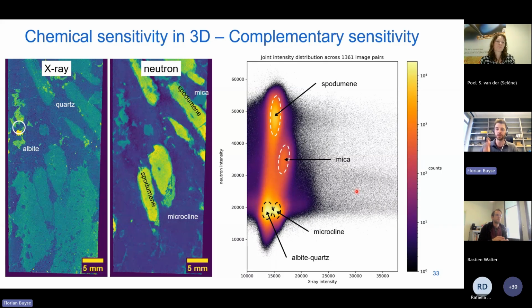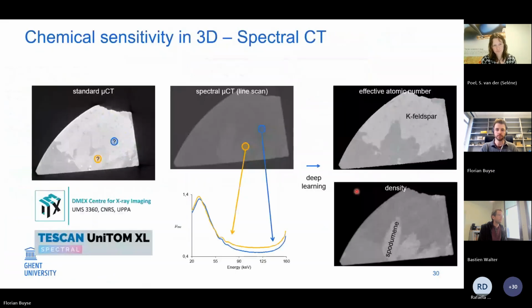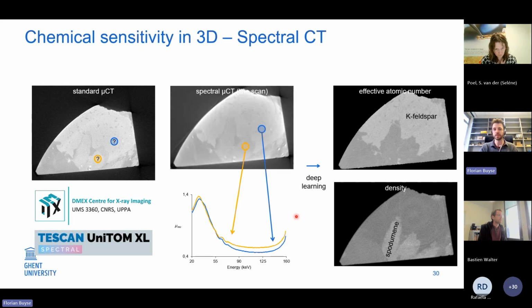Whereas if you only looked at the standard CT scan of the same slice, in some cases the difference is too low, especially if I go back to this example of deep learning. The image you see in the center is slicing through these different types of energies. At first, you don't really see such a big difference between those.